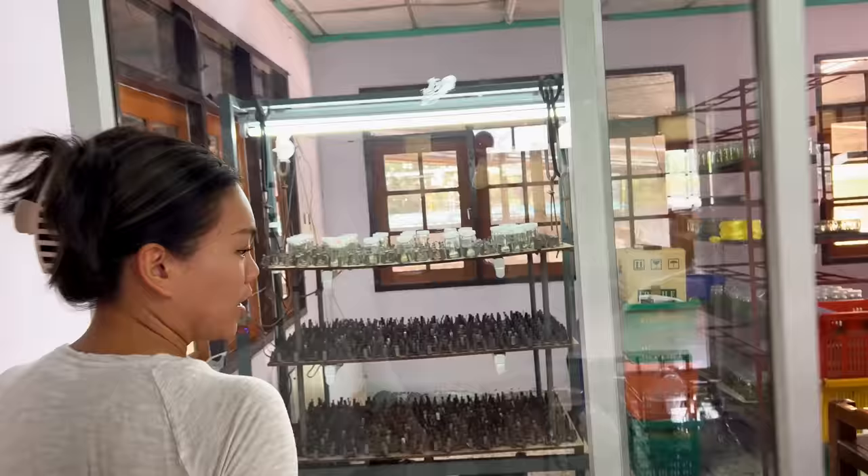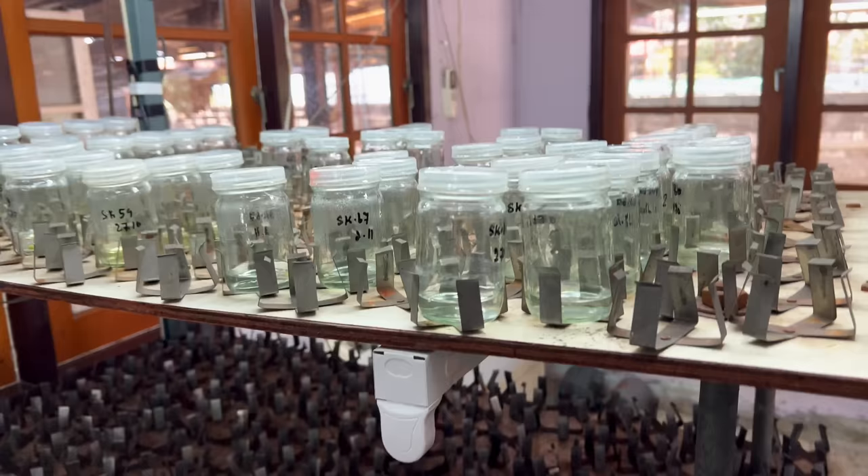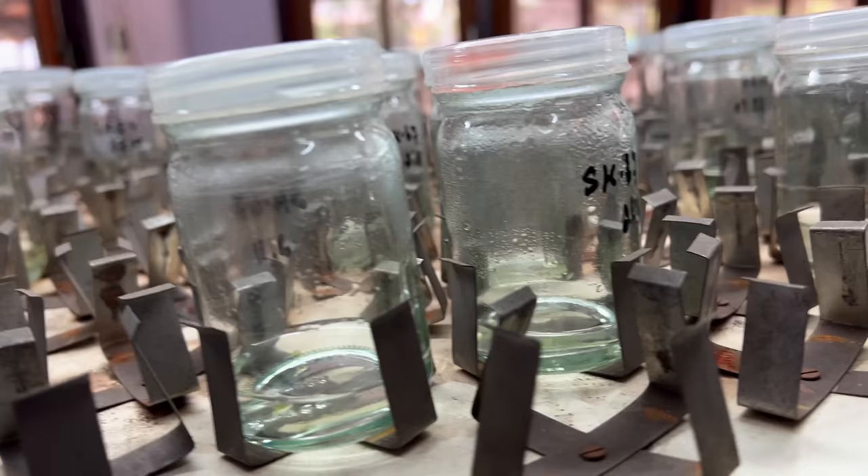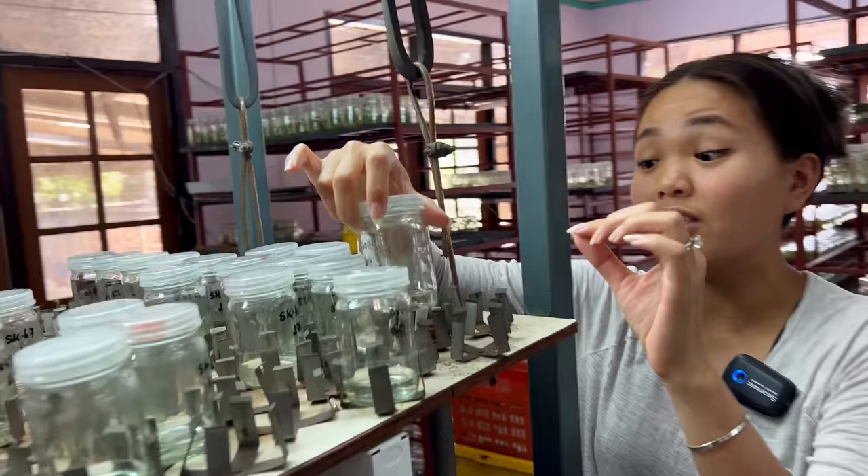It smells like a hospital in here. I want to show you in here. So these are all orchids. You can see those little things. We have to keep our eyes on it every day, morning and afternoon, to see if there's any growth. It's very interesting — I like it a lot. I get to see something growing, changing.